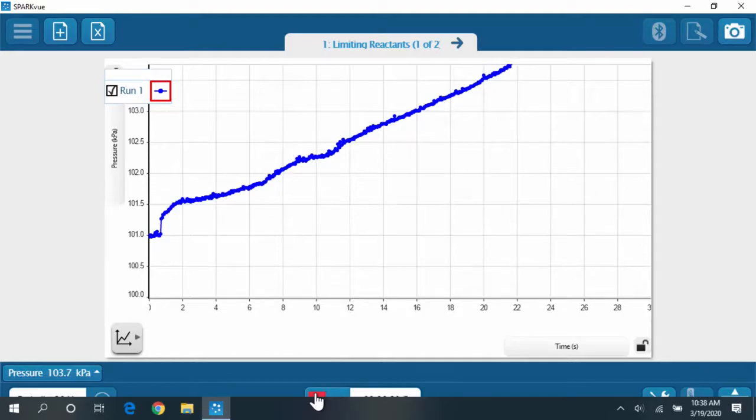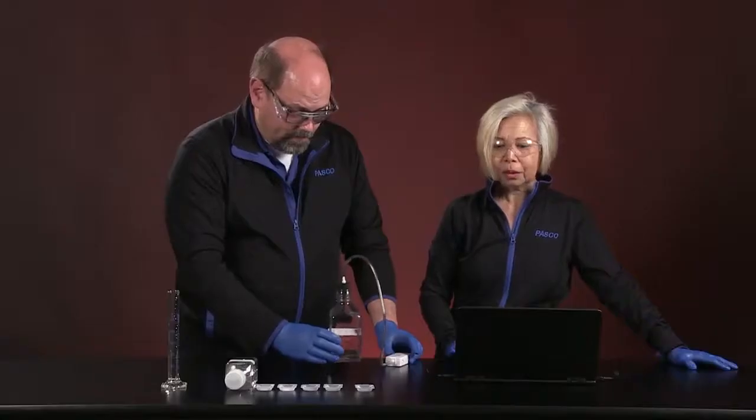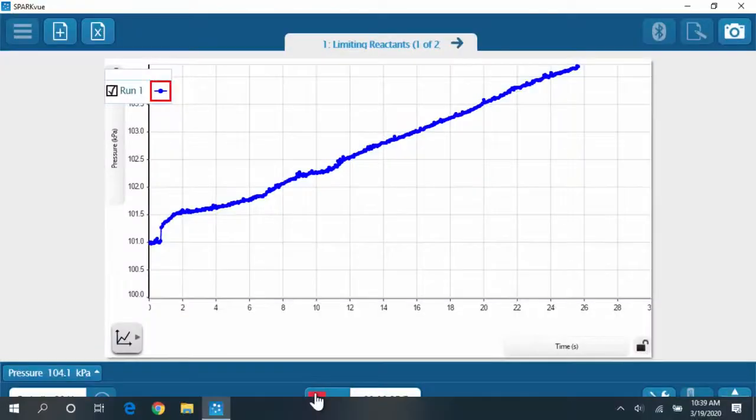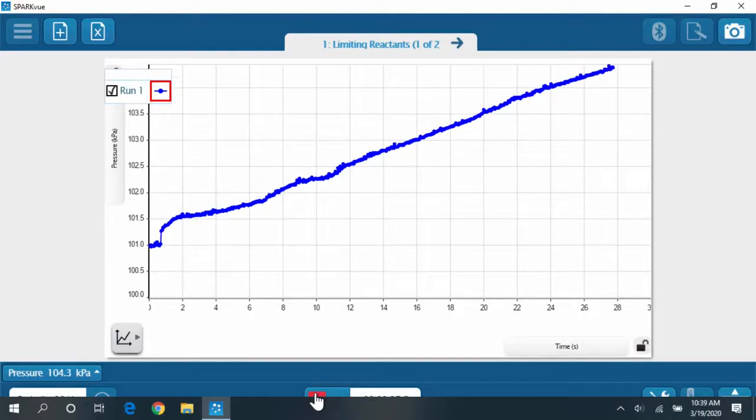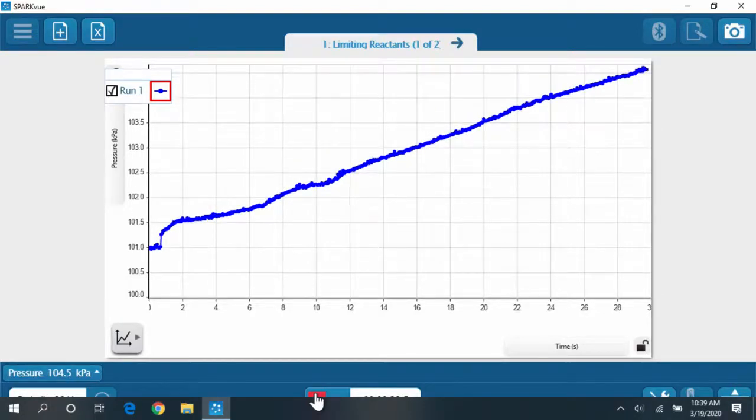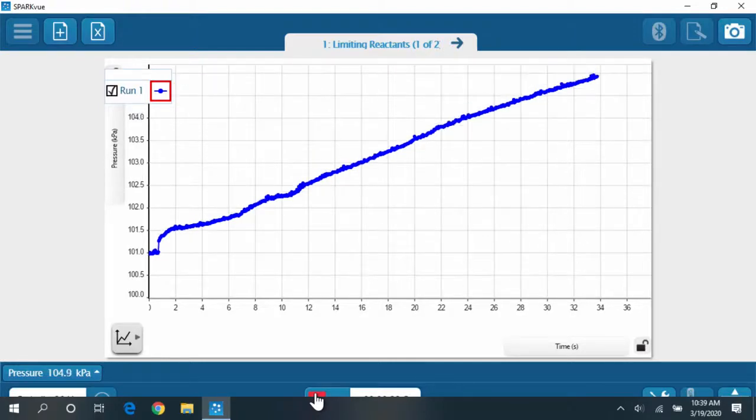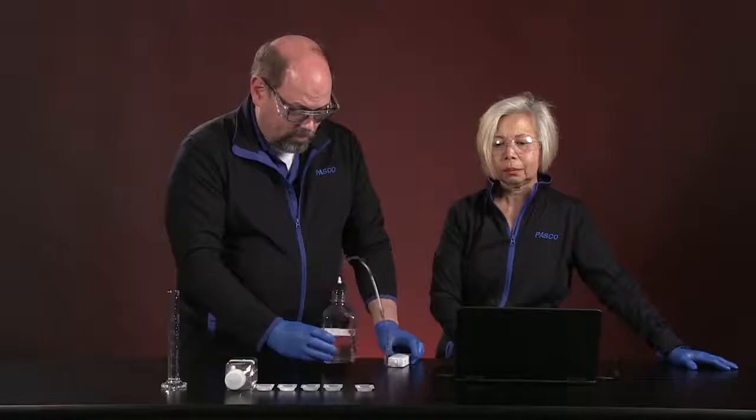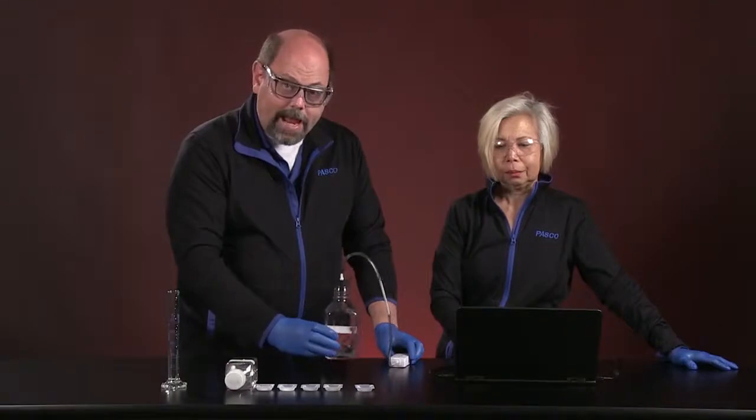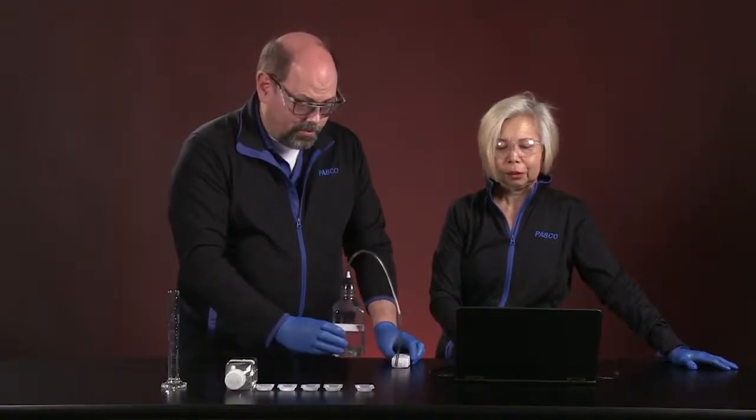And how long are we going to measure this? We're going to be measuring this for about 60 seconds. Okay. Unless it flattens out very quickly, in which case all of the material is reacted and all the CO2 has been given up. That's right.